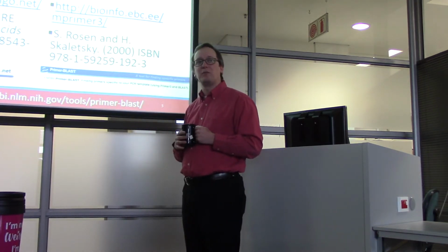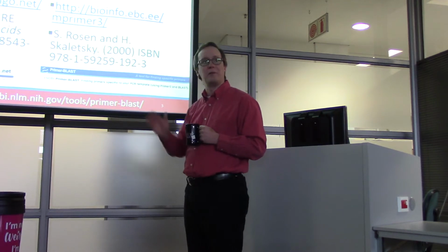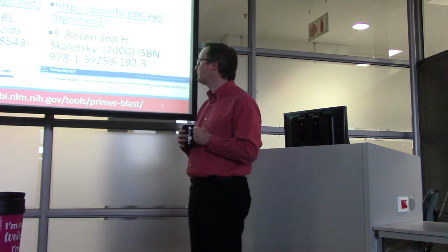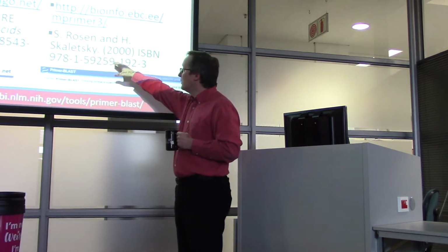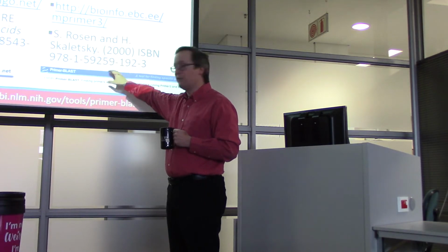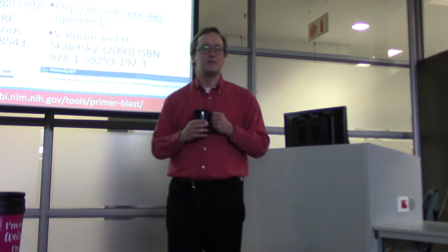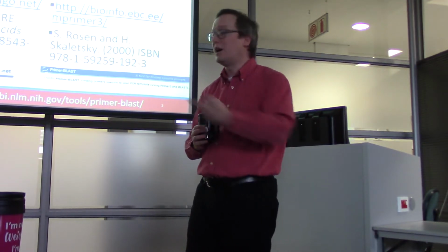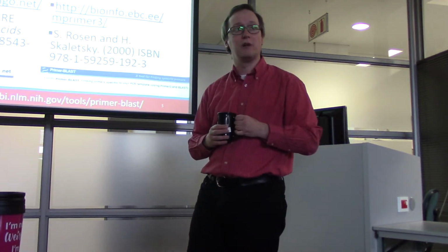So from a bioinformatics perspective, there's actually a pretty big gulf between commercial and open source tools for the same purpose. Now, I would note that you may have used Primer3 without even realizing it. If you've made use of the Primer-BLAST service over at NCBI, something is powering that website, and behind the scenes they have Primer3 running.